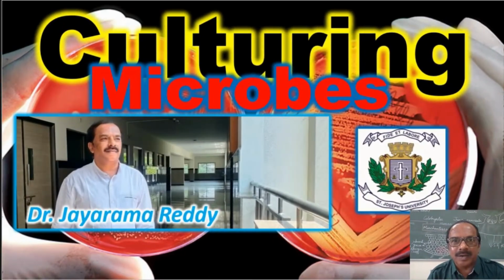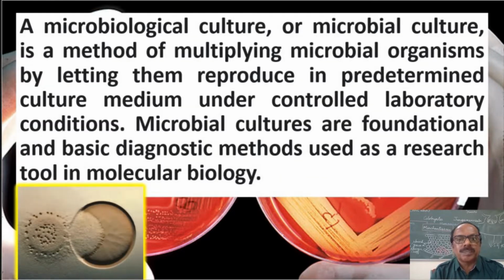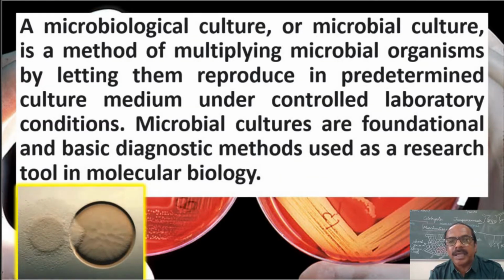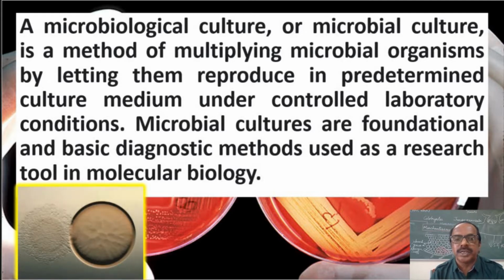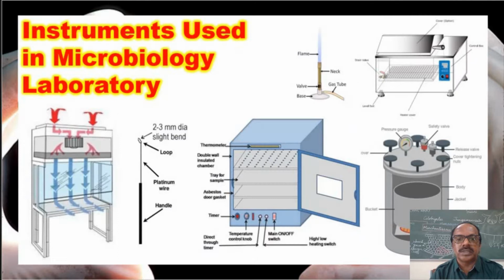Welcome back and welcome to a new video on culturing microbes. A microbial culture is a method of multiplying microbial organisms by letting them reproduce or multiply in a nutrient medium under artificial laboratory conditions. These are the basic instruments that you require in a microbiology lab.